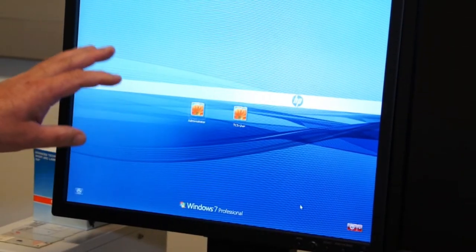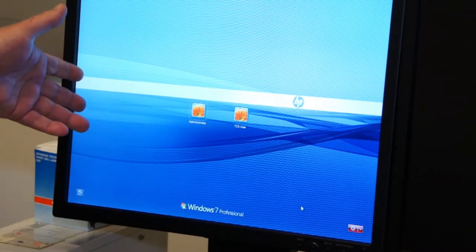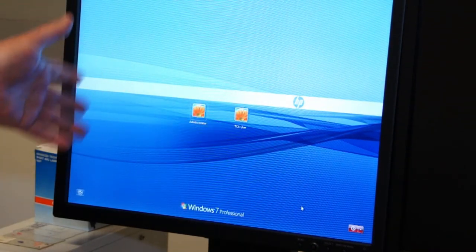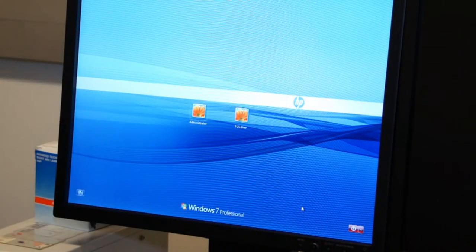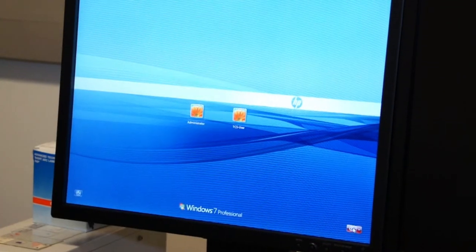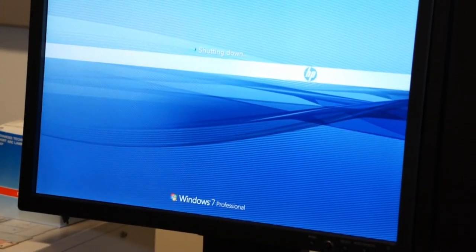Because the main power to the system also turns on the computer, Windows starts by itself. Therefore, in shutdown, you must first close Windows before you can turn off the power to the system. So we close Windows and wait until Windows shuts down completely.